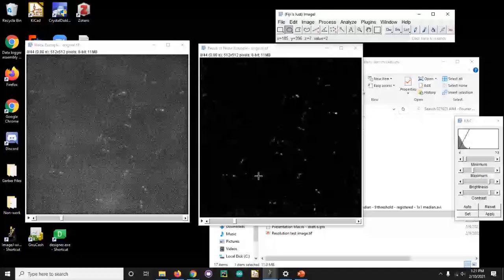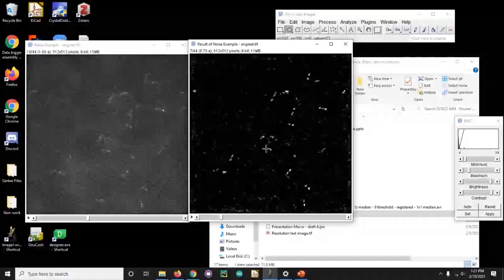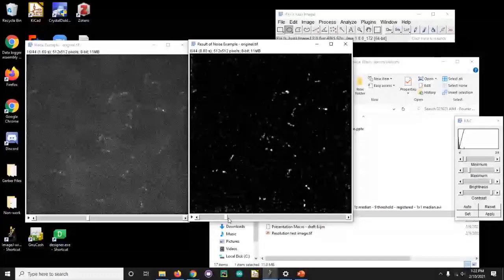So the next thing we need to do is, we still have this background signal that's flipping around. So now I can think about it again. If we look in space, the catch is we've got ourselves in a corner: the size and intensity gradient of our background now looks just like the bacteria. So that tells us in position space, we're out of options. Our background looks like our signal. So now we need to think outside the box a little bit.